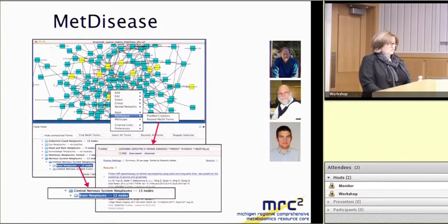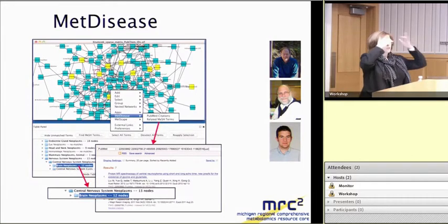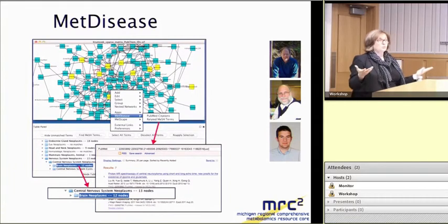And in this case, the nodes in the network represent metabolites, and the edges actually represent correlations. So essentially, if I took the matrix that Barbara and Chuck showed you, a correlation matrix where I calculated the correlation coefficients between compounds and set a certain threshold for significance, so, for example, I would take only the most significant correlations, then the compounds would become nodes in this network, and the correlation coefficients would become edges.